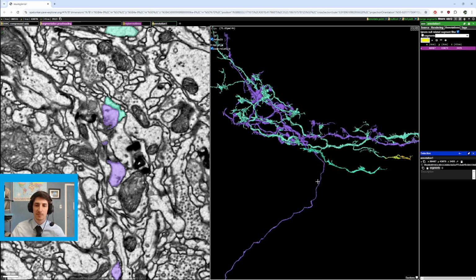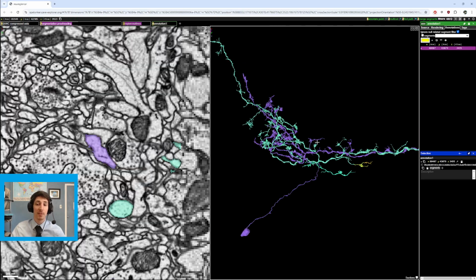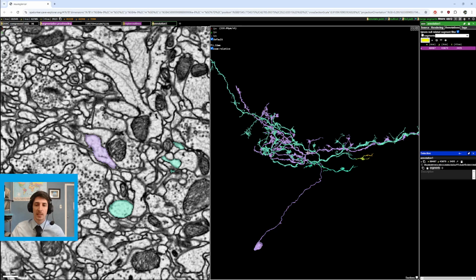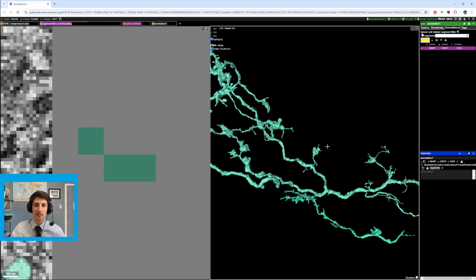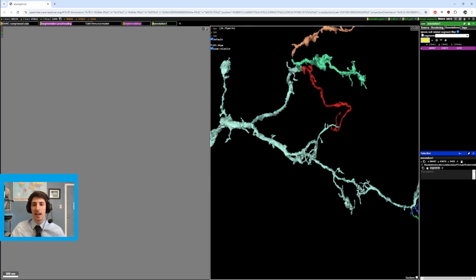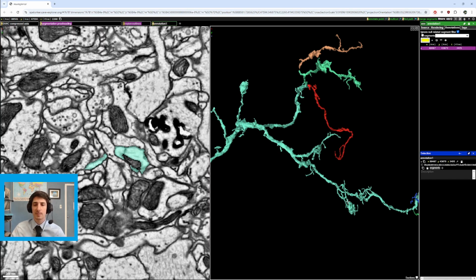So why did we investigate this area and find that it was a merger? Well, because these cells don't typically overlap with themselves like this, but they do overlap with similar cells like this. And because if we get rid of this, this pretty much has all the pieces of the cell, right? It's got these boutons, it's got axonal bits. The axon and the dendrites can kind of smush together, especially in these smaller cells.